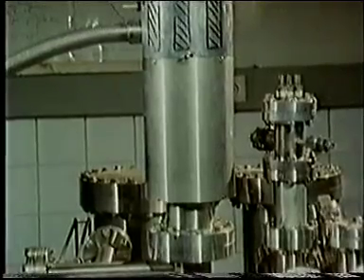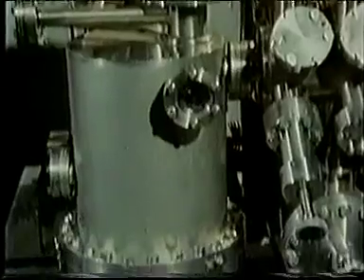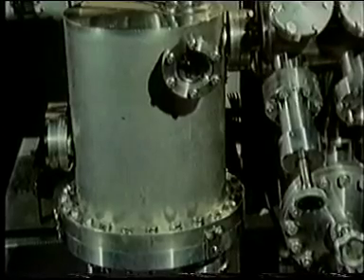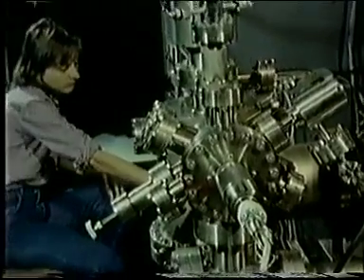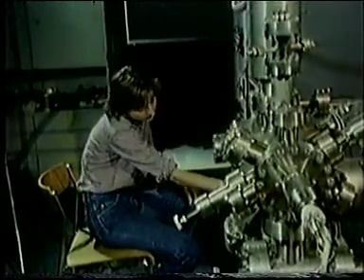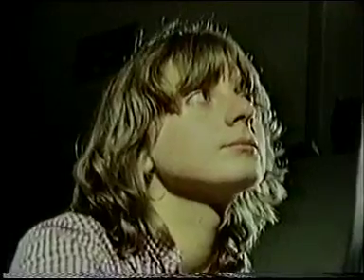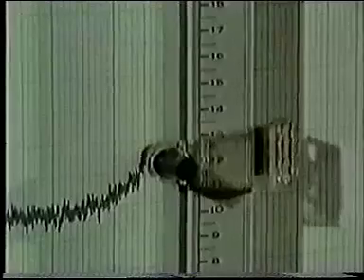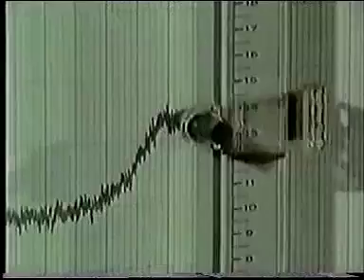The X-rays come from a generator above the main chamber. They knock out 1s core electrons from the adsorbed nitrogen. The kinetic energy of the nitrogen 1s electrons is measured by an electron analyzer housed within the spectrometer chamber. This kinetic energy is less than the energy of the exciting X-rays. The difference is the binding energy of the nitrogen 1s electrons. The spectrometer plots out binding energy in electron volts against the electron intensity.